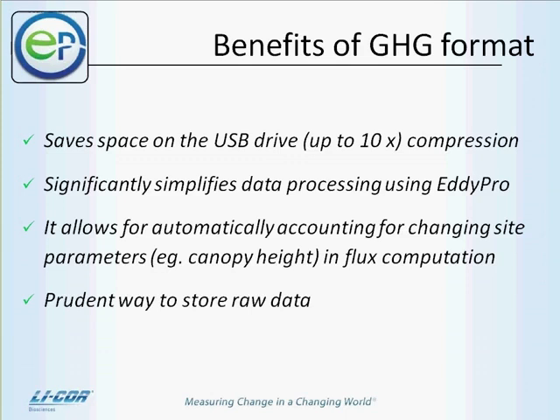Israel, before you move, may I ask an audience question? Sure, go ahead, Angela. I have the LI-7500 OpenPath Analyzer. Can I get GHG files?